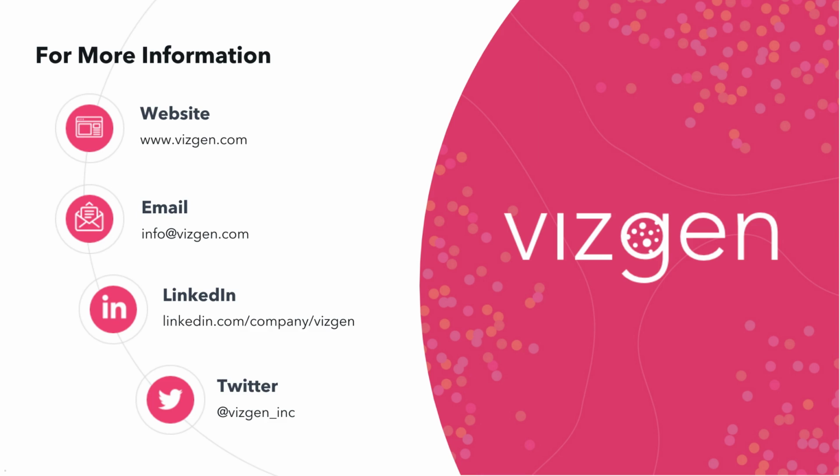Thank you. Next question. Have you tried MERSCOPE in FFPE human brain tissue? Yes, so we have tried both fresh frozen and FFPE human brain, and both work very well.